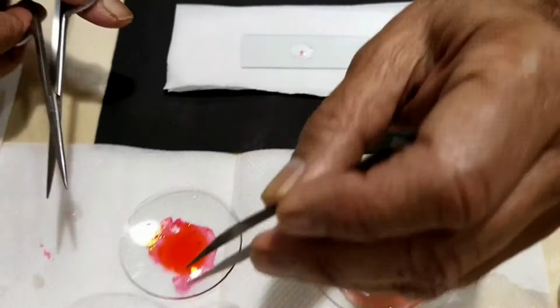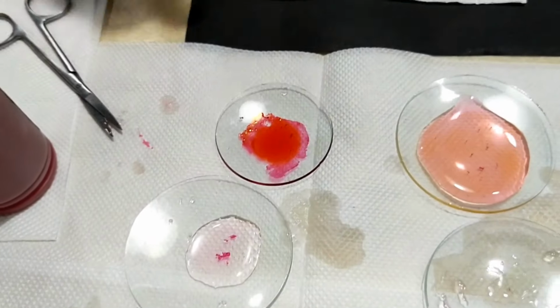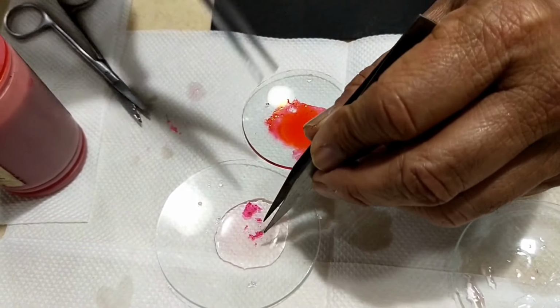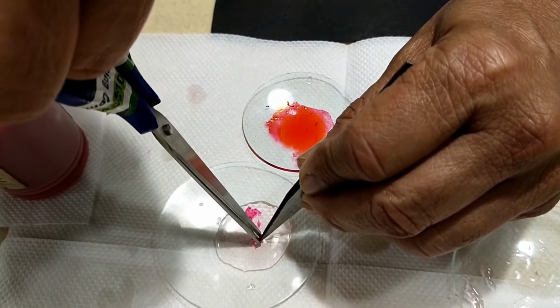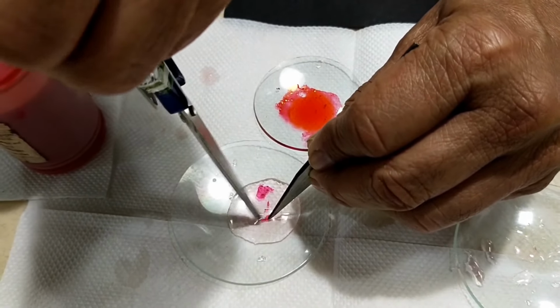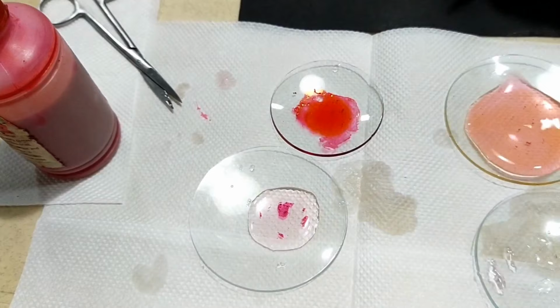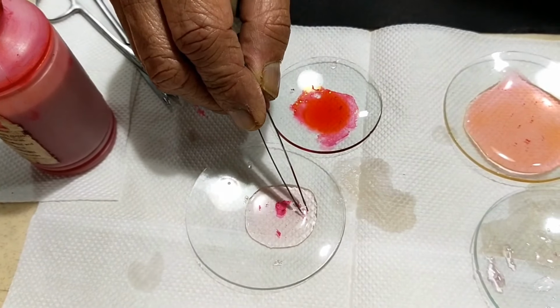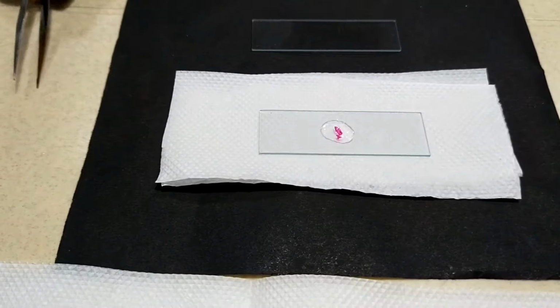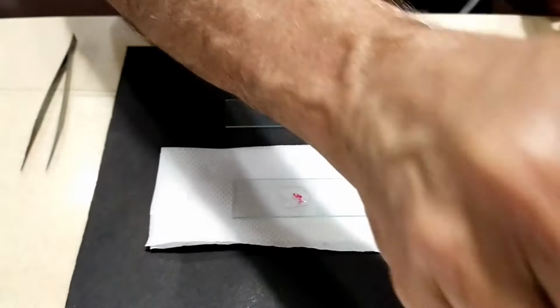Okay, I'll take one more small piece. There are so many small pieces, and I can take a small piece here. It's very nice work, but for biology practical, you should have a delicate hand, they say. It should not be harsh. Okay, I'll take this piece, whatever it is. I'm taking it here. See, almost 3 pieces here. Fine. I think I can put a drop of water additionally, and then put a cover glass.